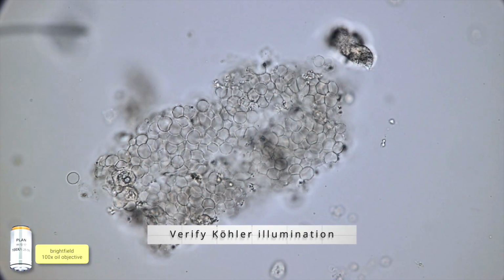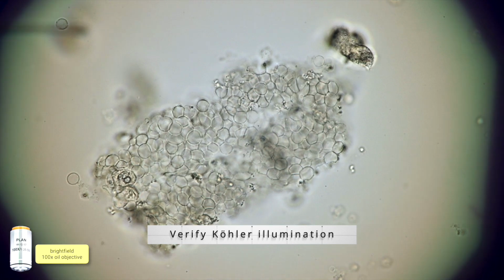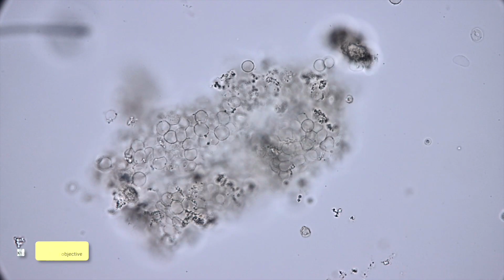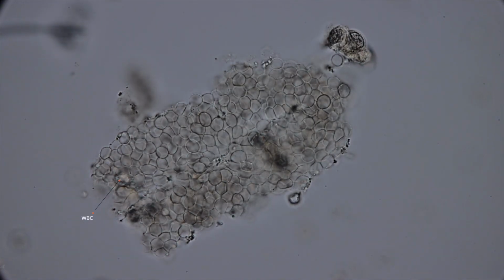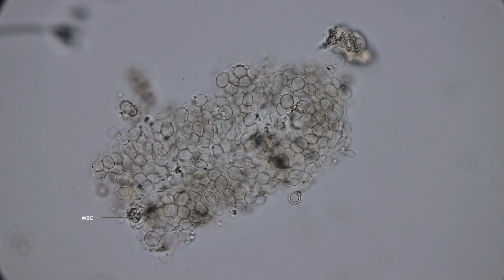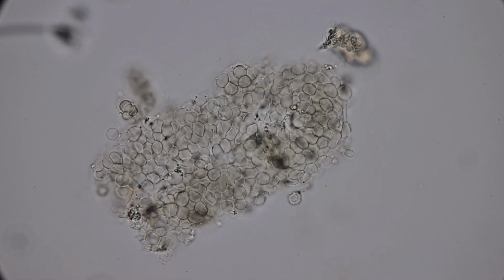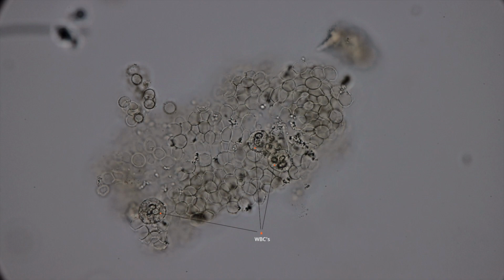Here under the 100x oil objective, again, we're going to verify Kohler illumination, center the image of the field diaphragm, and focus up and down to get a better idea what those other cells are. Clearly there's a white blood cell there, another one there. Continuing to focus up and down, it looks like there's a few other white blood cells you can see clearly right here.